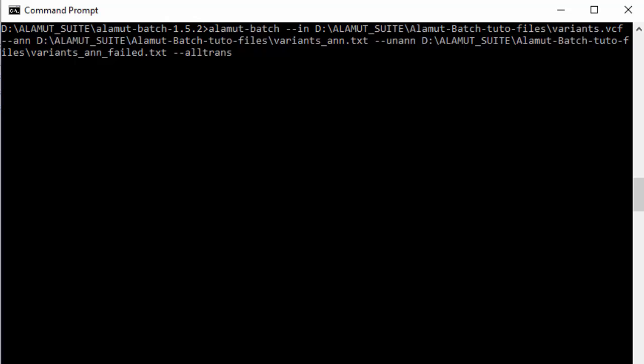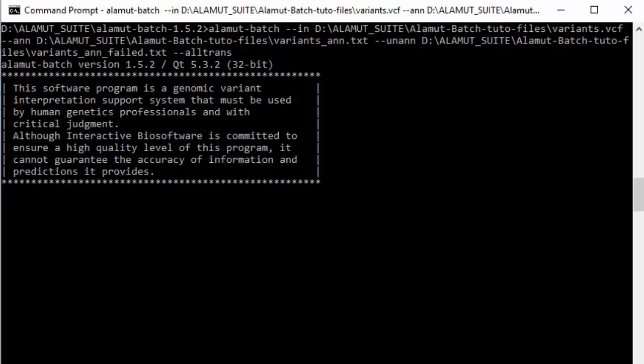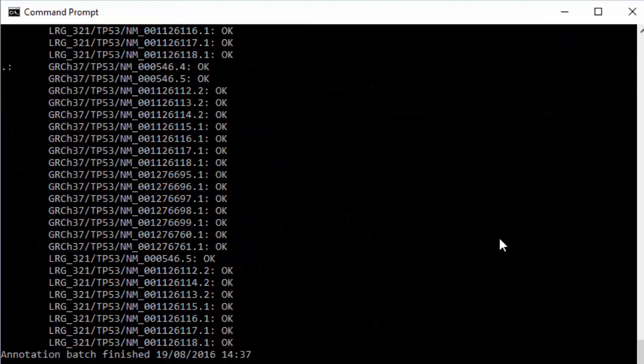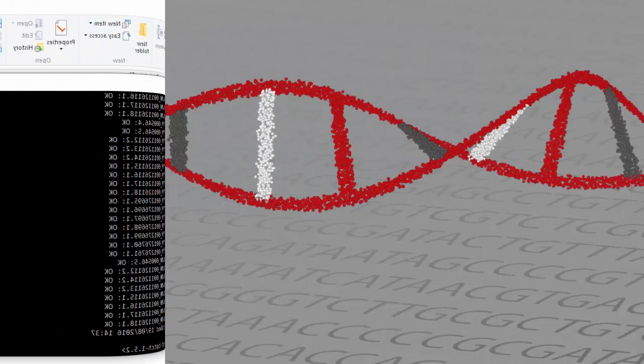More command line options are described in the user manual. Hit the return key — the analysis is launched. When it's complete, annotations will be available in the output tab-delimited file.